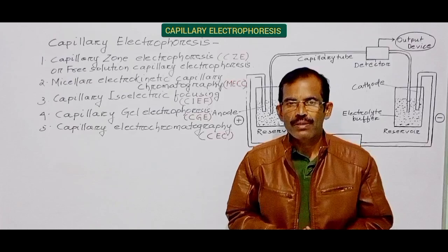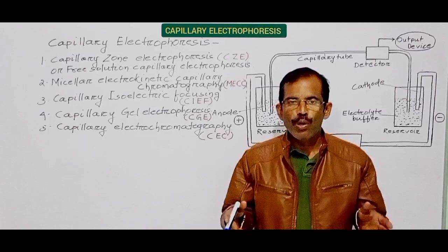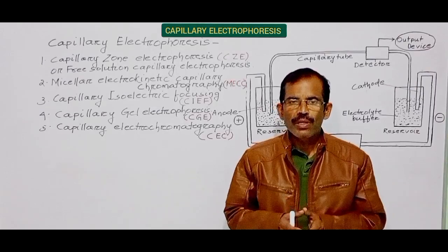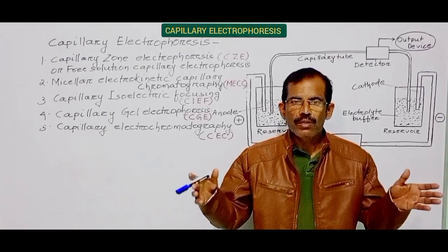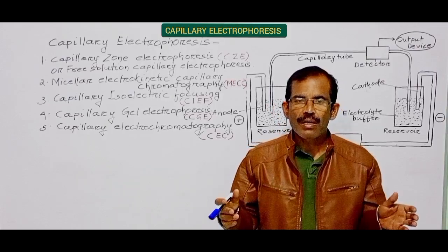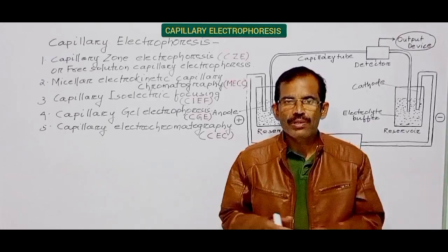Capillary electrophoresis is a powerful technique that employs narrow-bore capillary tubes for achieving high-efficiency separations of both small and large molecules. These separations are facilitated by the use of high voltage. There are different modes of capillary electrophoresis.